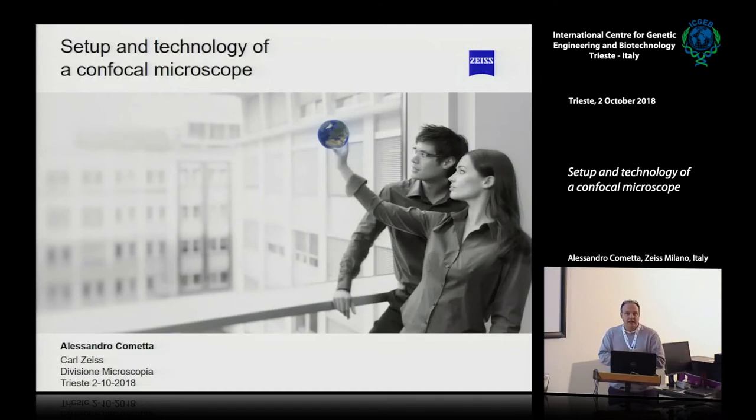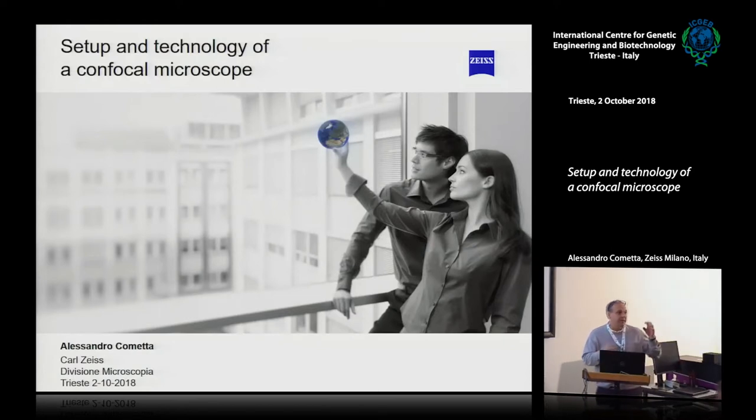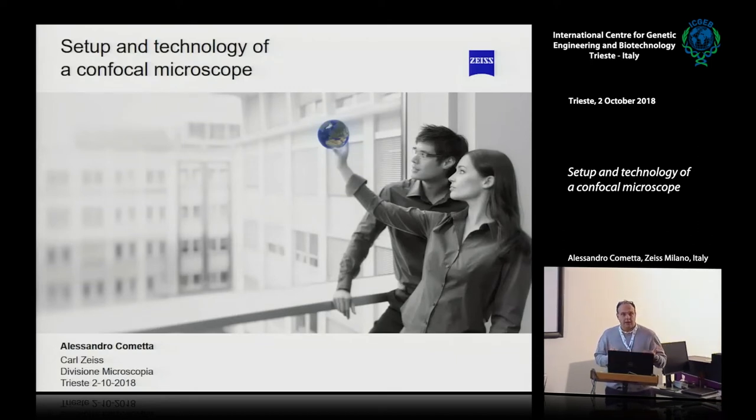I would like to introduce my company for just a couple of minutes, and then we go directly to fluorescence and microscopy. The previous lecture is really, really important because it is the basics for every experiment. And it is much more important when you work on a confocal, because on a standard fluorescence microscope, you just have two or three cubes.